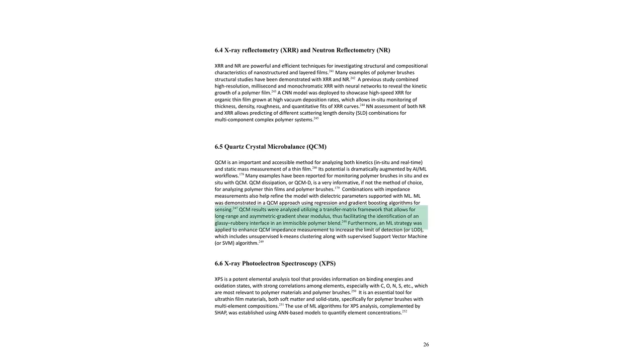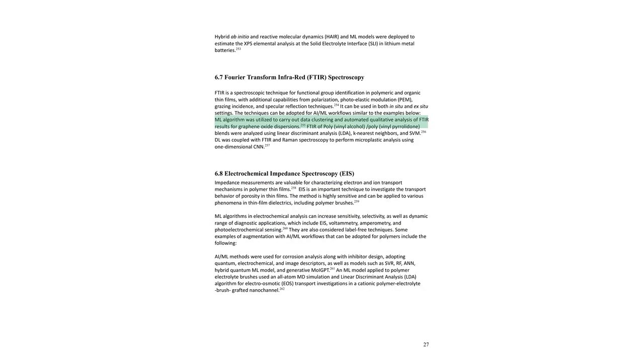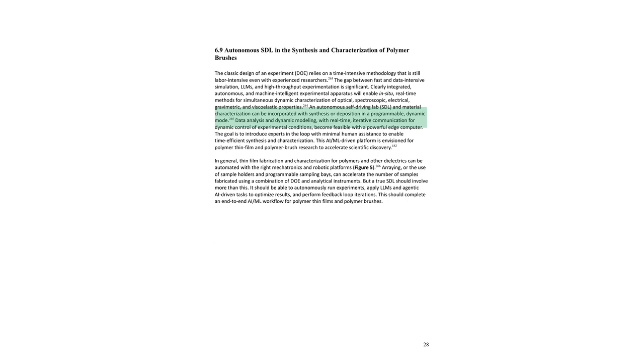Similarly, for X-ray and neutron reflectometry, neural networks can predict scattering profiles, and for QCM, ML algorithms can help analyze complex viscoelastic data to better understand film properties.